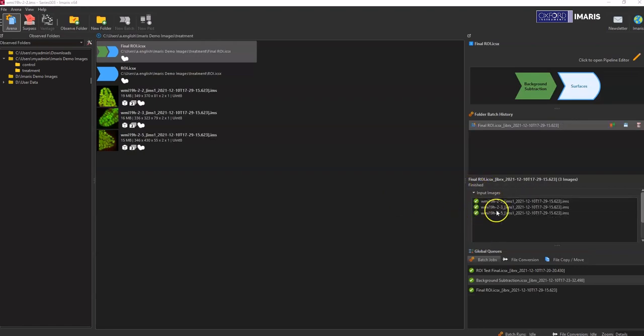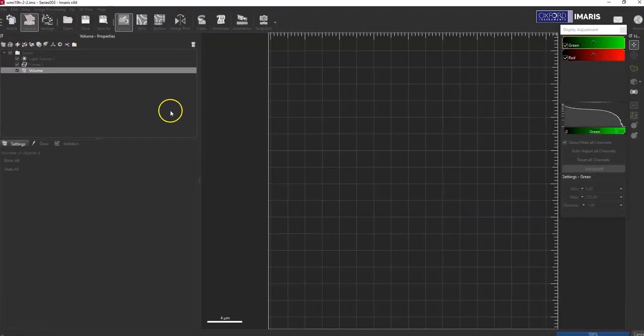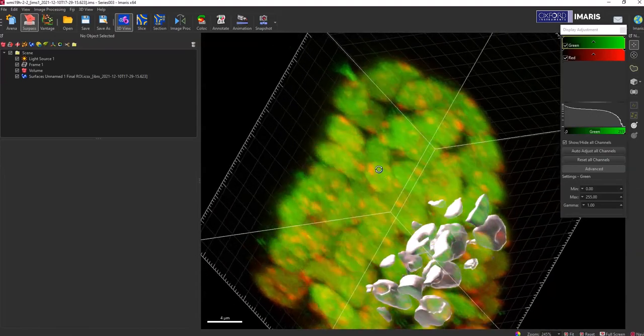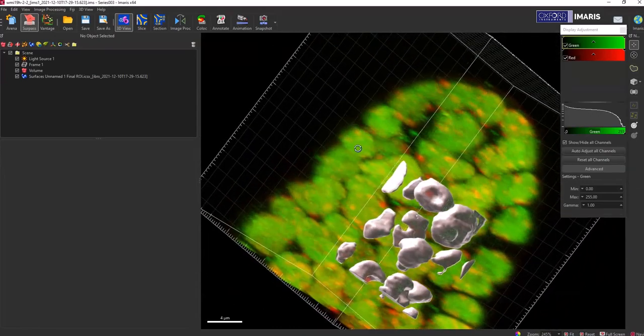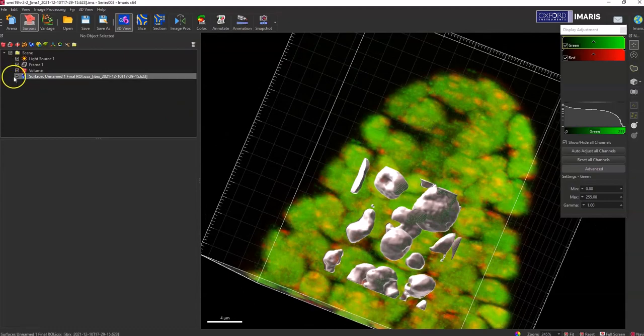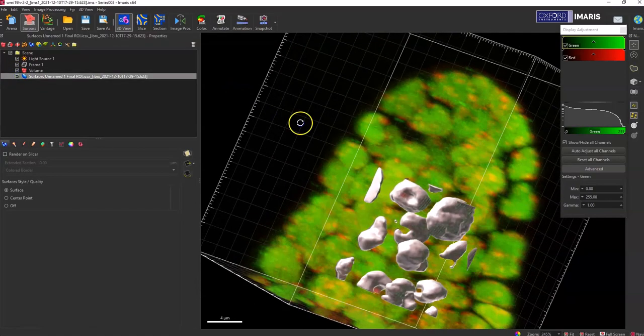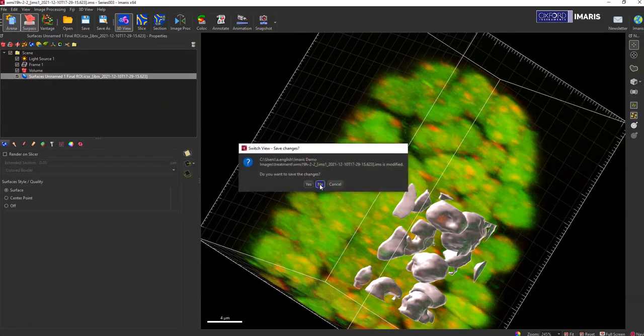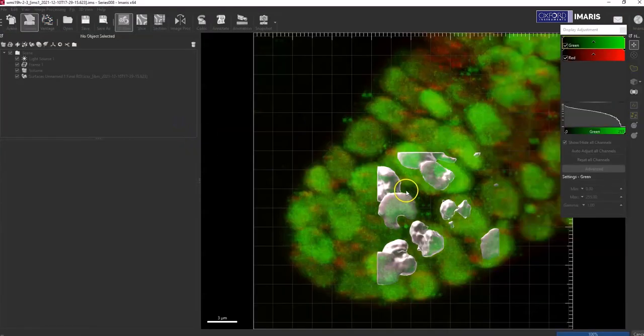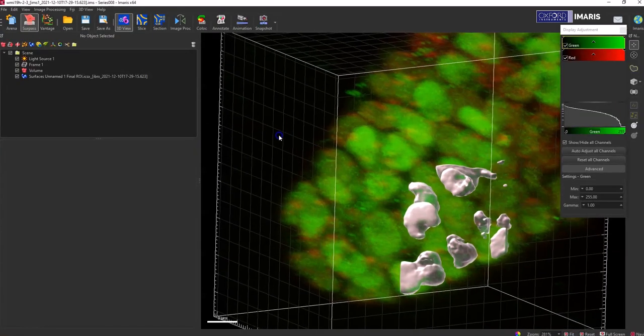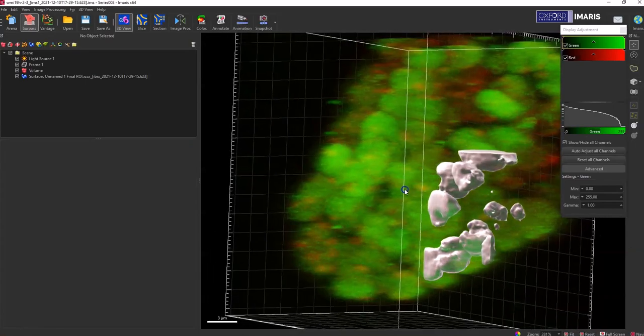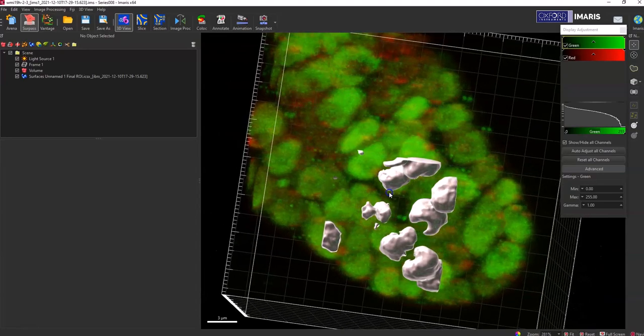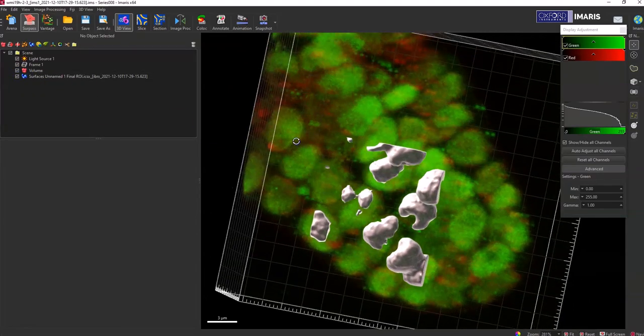Okay, all of our batches have completed running and now we'll open them up. You can see that it has that smaller region that we defined here. It's going to come on and off. And then we go back and you can look at the other images that created the region of interest, and that's the only place where the processing did complete.